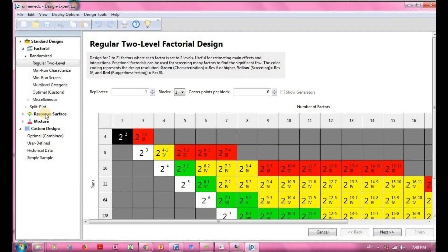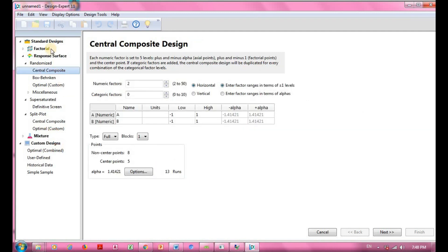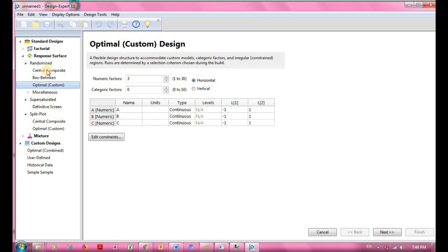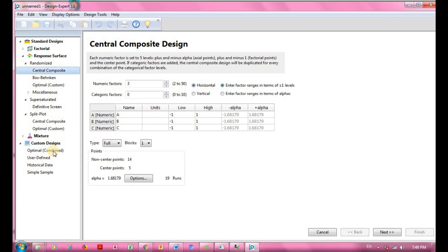I'm going to go for Response Surface, specifically Central Composite. Other options available include Box-Behnken and more. Click on Central Composite. Under Central Composite, the most important thing you must do is specify the numeric factor — the parameters that you use in your experiment.